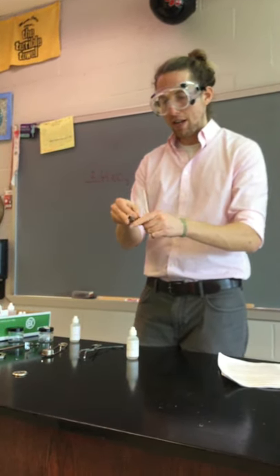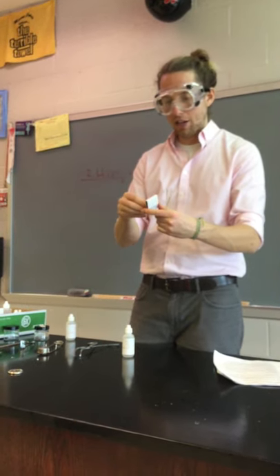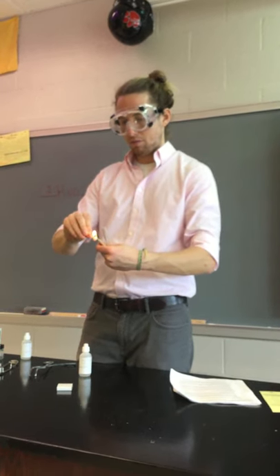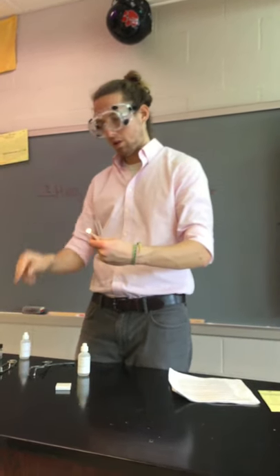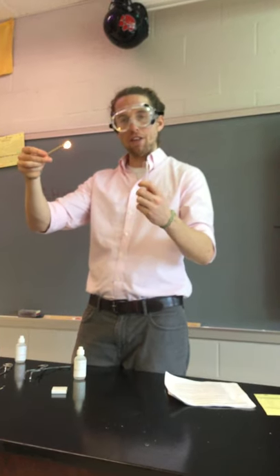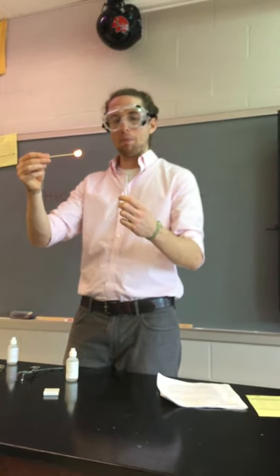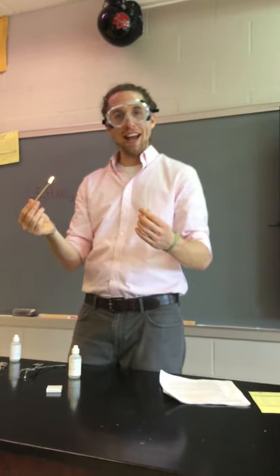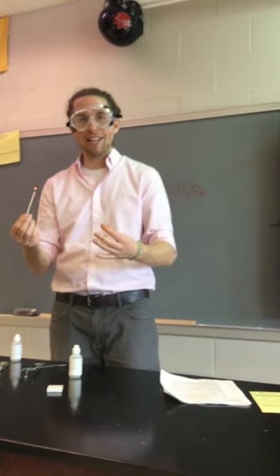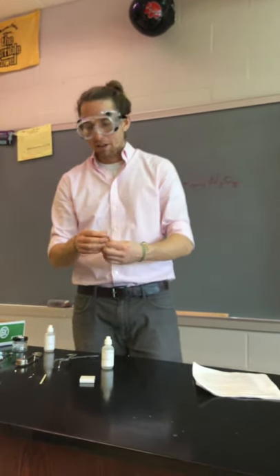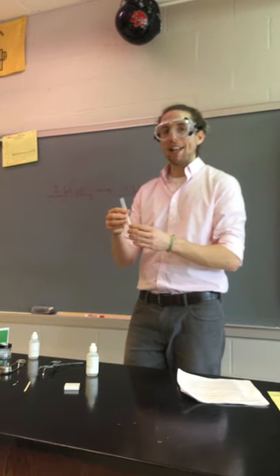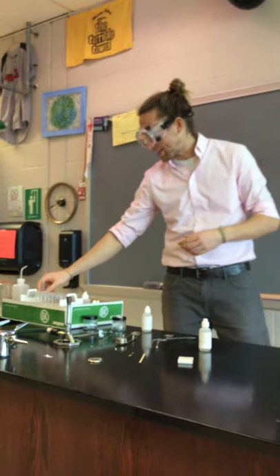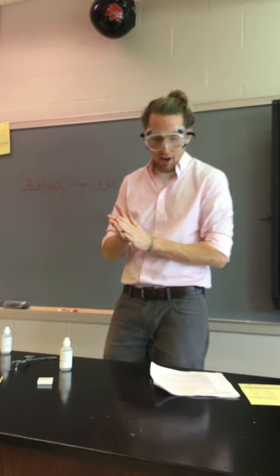We're looking for a gas to be given off from this reaction in the test tube. All right, so I've got a flaming splint. We've got a reaction giving off a gas in here. It is warm to the touch. Let's see what happens when I put the flaming splint into the test tube. And you can hear that. Something ignited. So that's actually hydrogen gas being ignited by the flaming splint, and that hydrogen gas made a little sound as it escaped from the test tube. So that is reaction number two.